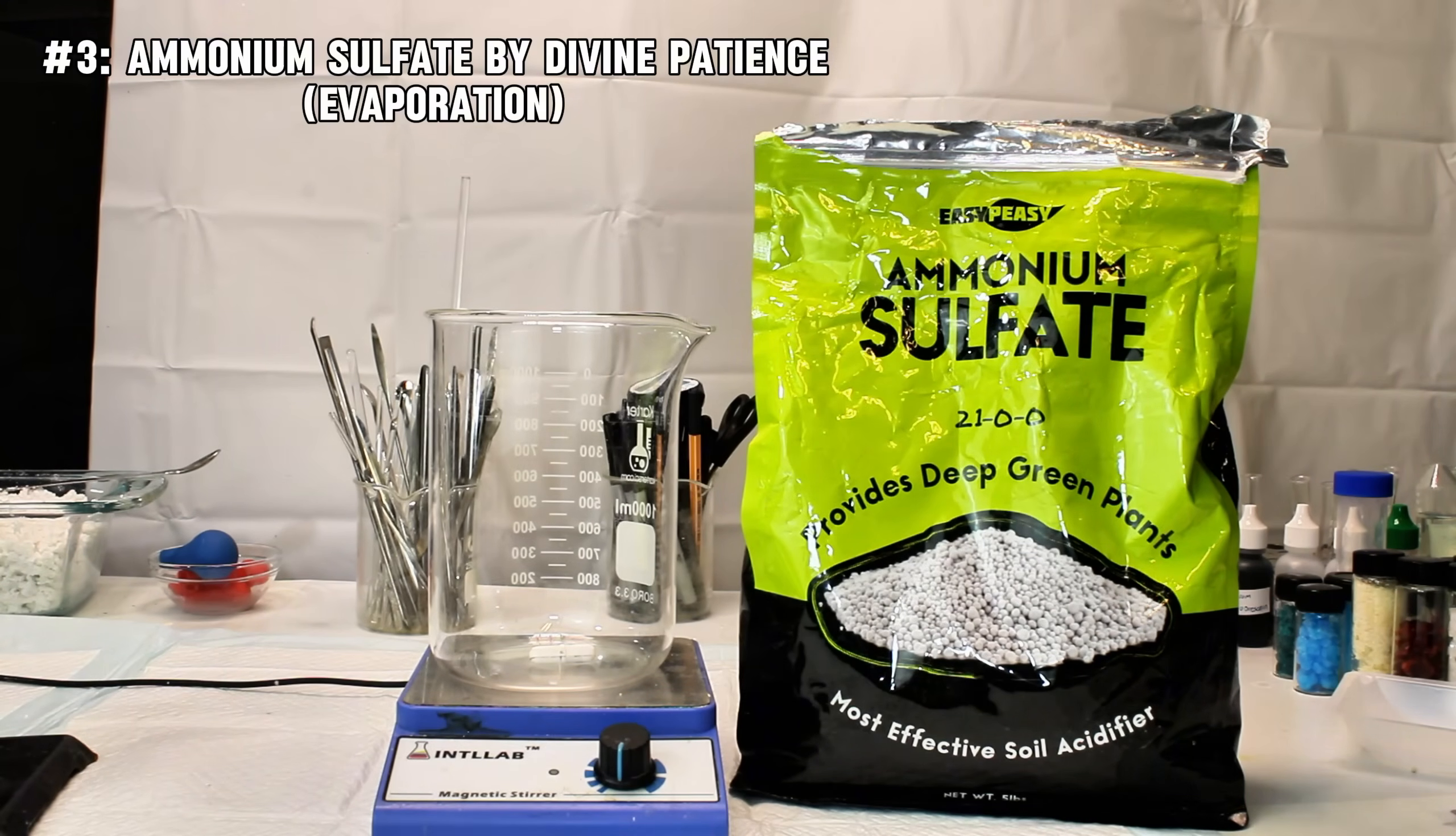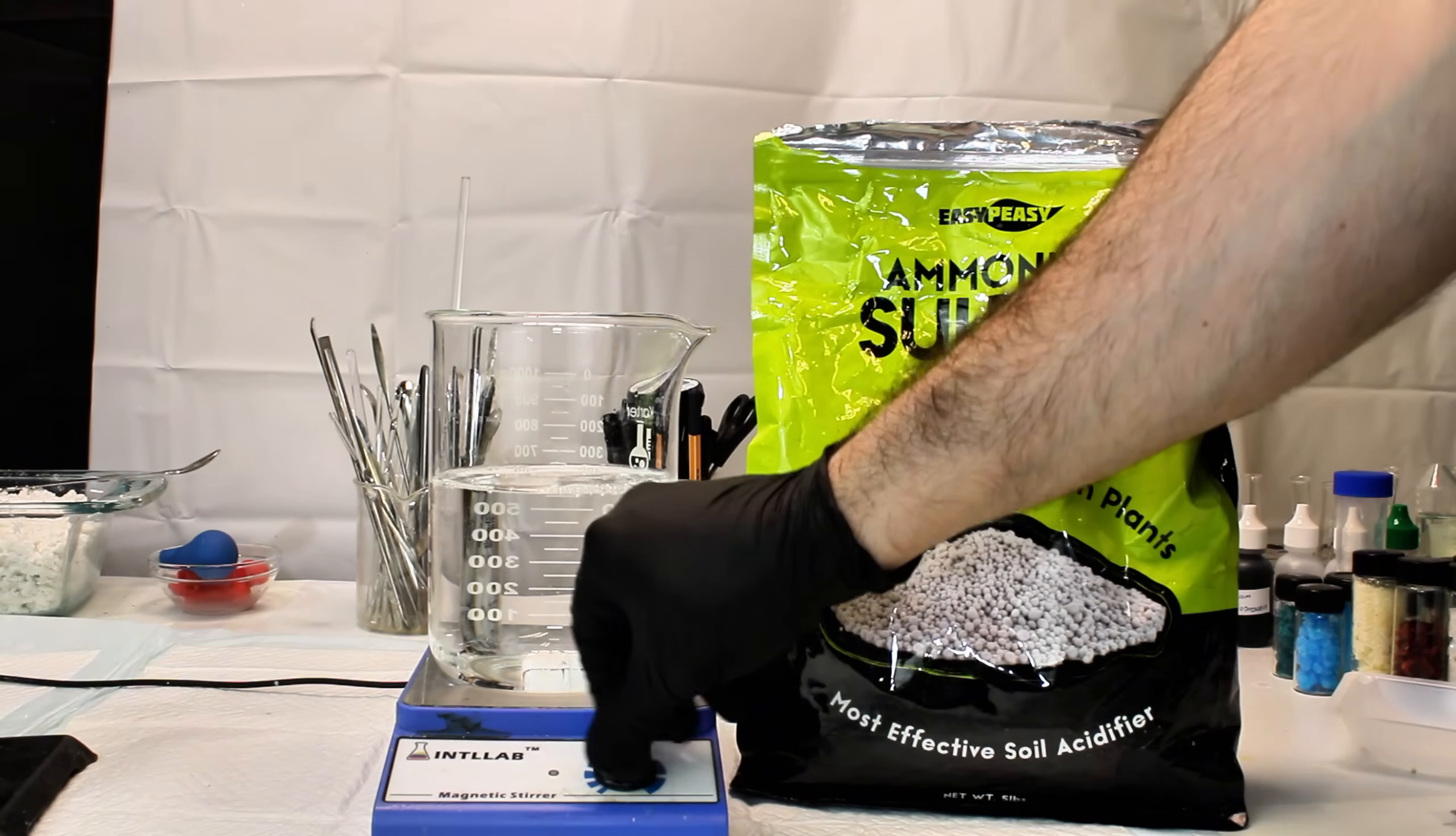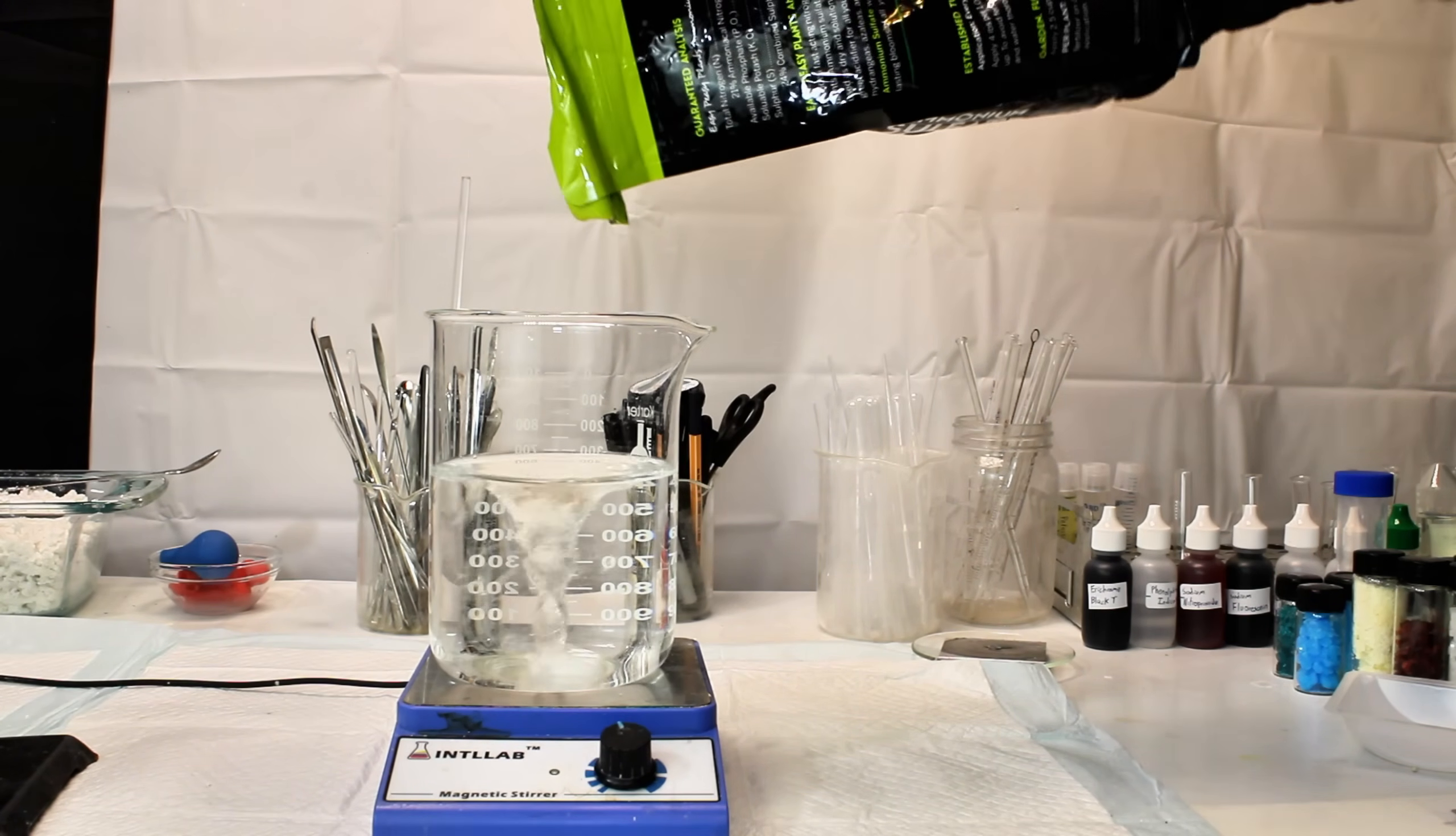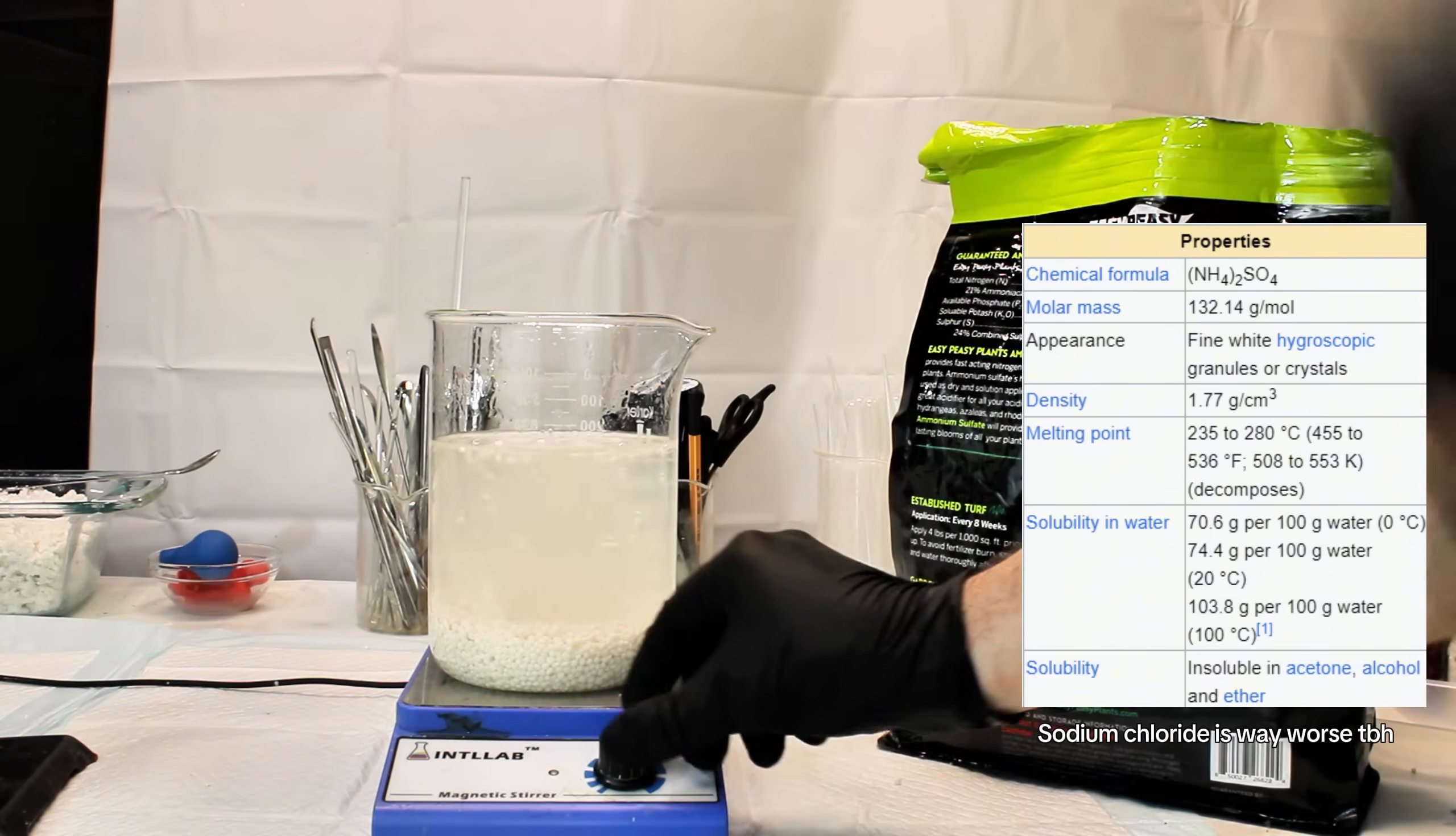For my third and final fertilizer cleanup, I decided to try ammonium sulfate, which was probably the least satisfying and most tedious of all, which is why I saved it for last. This is because unlike urea, ammonium sulfate has a very shallow solubility curve. This means that a similar mass of ammonium sulfate will dissolve at high temperatures and low temperatures.